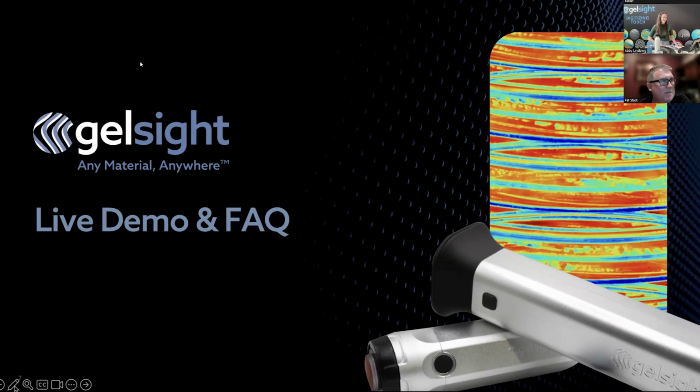And the last question at the moment, how deep can imperfections be before the GelSight can no longer pick up the depth of it? Sure, there's a short answer and a long answer to that. The short answer is about 1.5 millimeters. The long answer is it depends on the geometry of your surface, as well as the depth of field of the camera and the thickness of the gel.